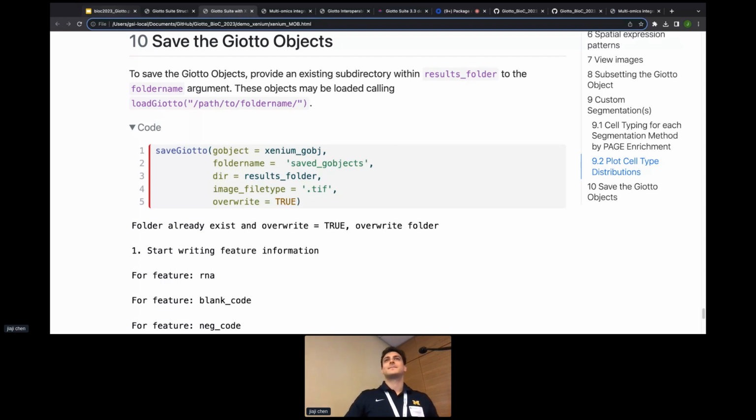So one thing, as a background, I wrote spatial feature experiment in Voyager, which does something similar to what you're presenting now, but I presented last year. When it comes to the transcript spots, in some Merfish data sets, they're huge, over 30 gigabytes. So how do you deal with the size of data, and how efficient is it? How much RAM does it take?